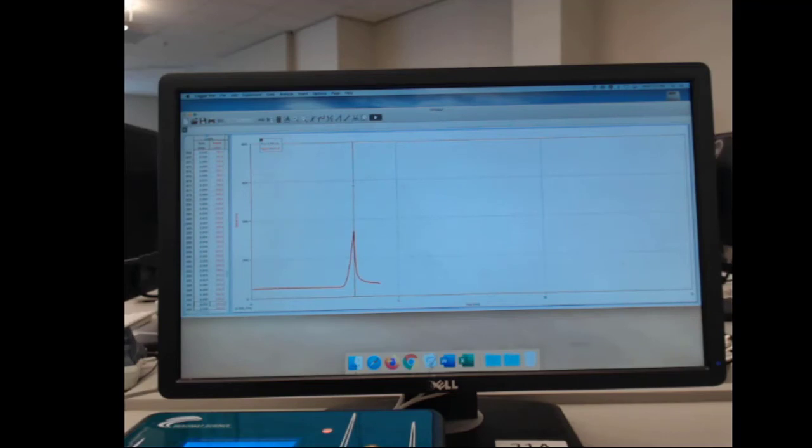And that is going to be 3.5 minutes. So 3.5 minutes in order to get that chemical compound, 3,3-dimethylbutanone, to exit the tube. That is to say, the retention time is 3.5 minutes.